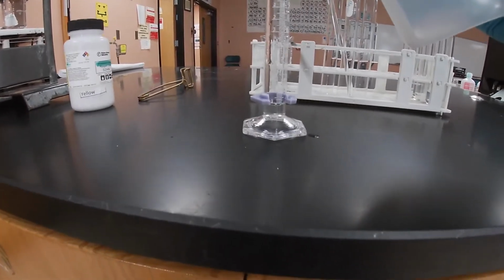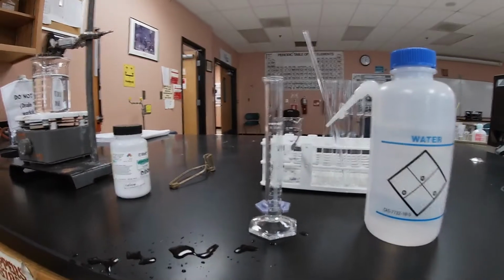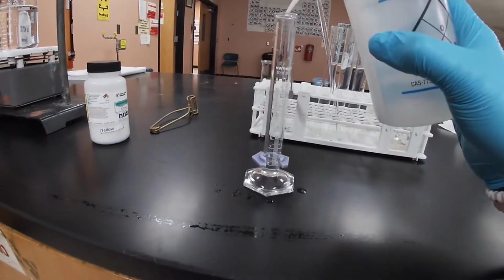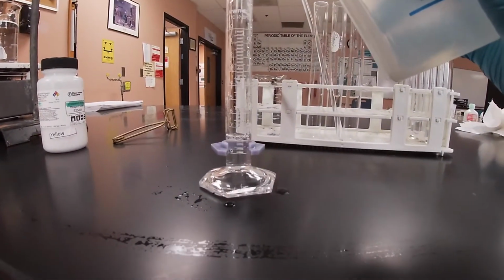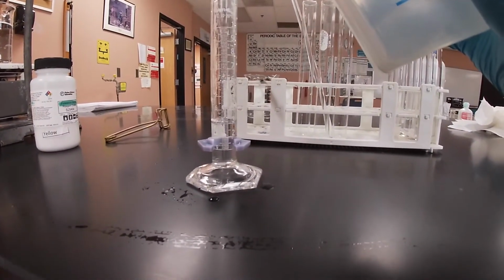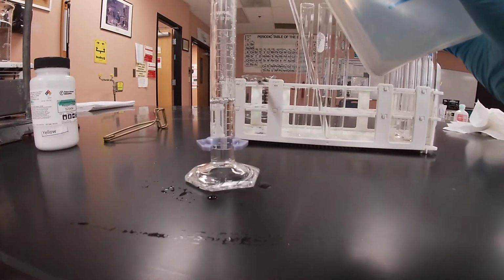Hopefully... nope, doesn't want to happen. Give me a second. So again, we're going to add water. How much are we adding? We're trying to get to 5 milliliters. And we're going to do this 3 times because we're going to do three different sets.